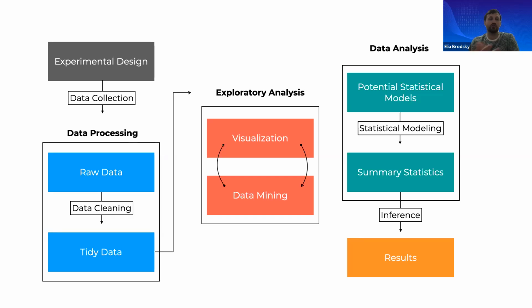And so if you imagine one sample having a coverage of average across the genome of 1,000 and another one having 5, again, average across the whole genome, then this metric doesn't really make sense, right? Because here I just have a lot more reads. So why would I just count from and compare them between each other? So FPKM and TPM were designed to address this challenge.